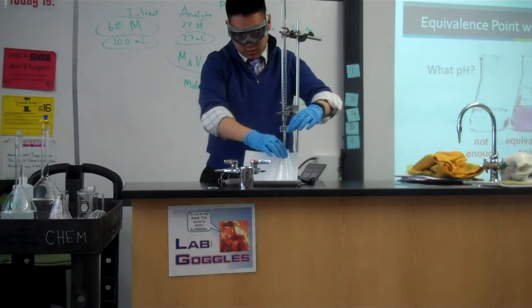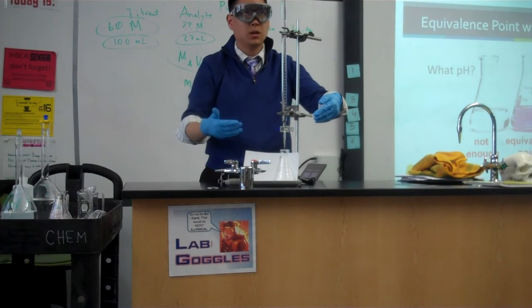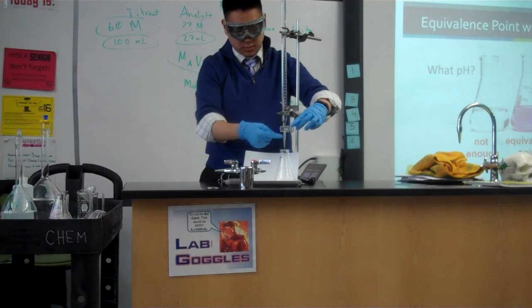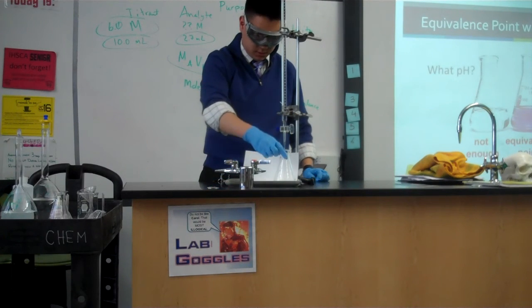You had a little bit of practice playing with this stopcock when you were washing it and when you were extracting the little bit for the tip. Now you want to make sure that you are in full control and only let a few drops out at a time. It's going to take some finesse to get used to it. You're going to be dropping and stirring constantly.